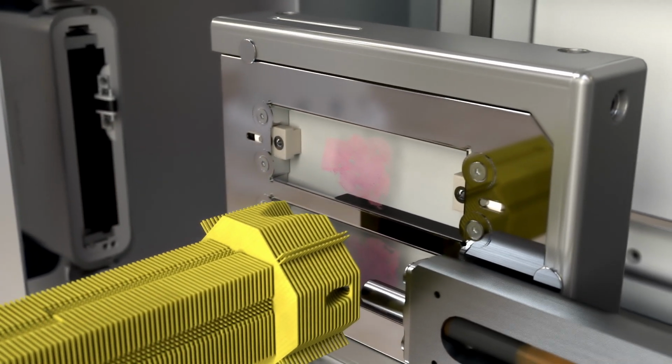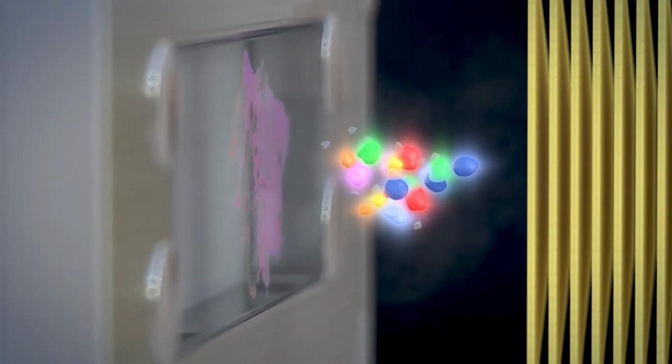You already have a compact ion source, this dual ion funnel device that is tuned to work optimally for MALDI imaging. It's really engineering art, and now on top of this we had to bring in a second laser in a way that it didn't disturb the other features.